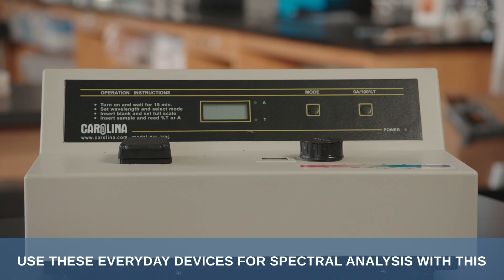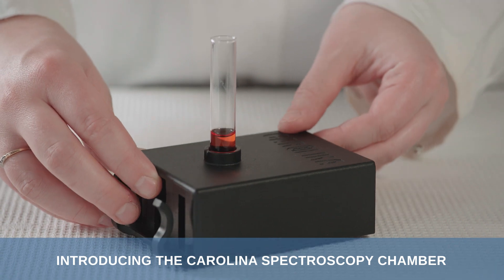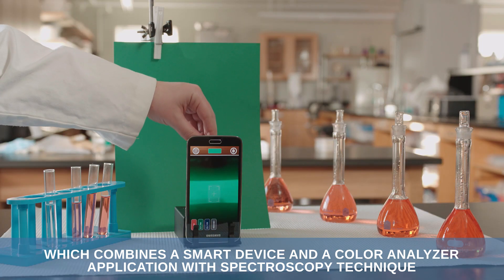Use these everyday devices for spectral analysis with this. Introducing the Carolina Spectroscopy Chamber, which combines a smart device and a color analyzer application with spectroscopy technique.